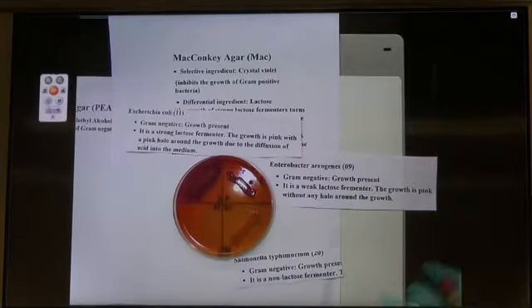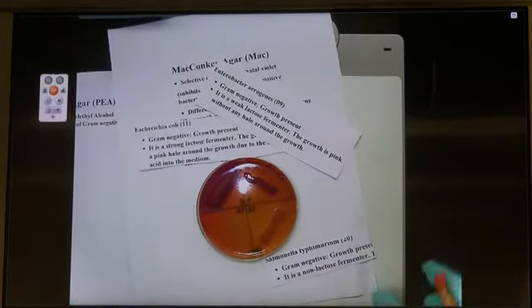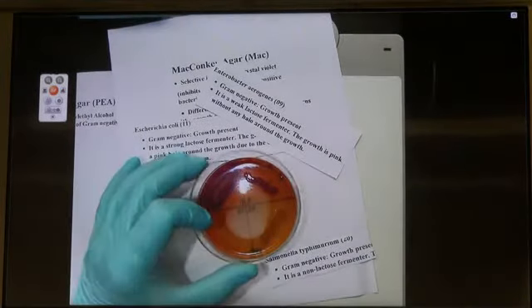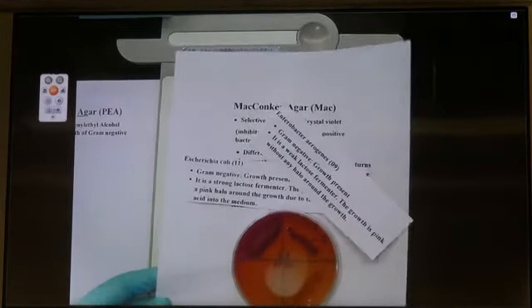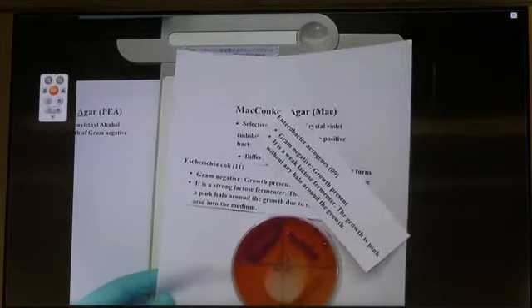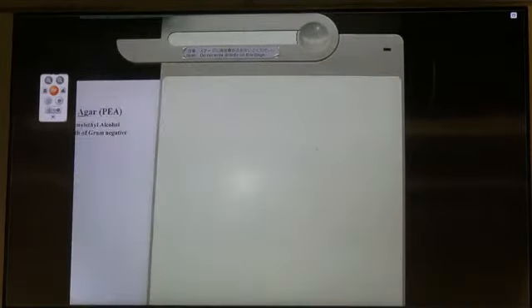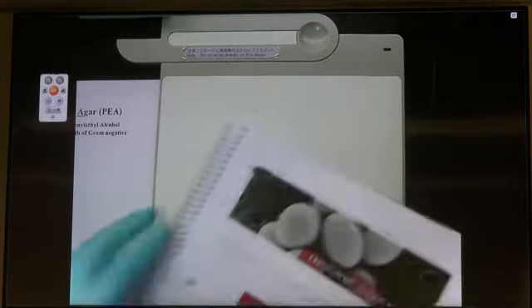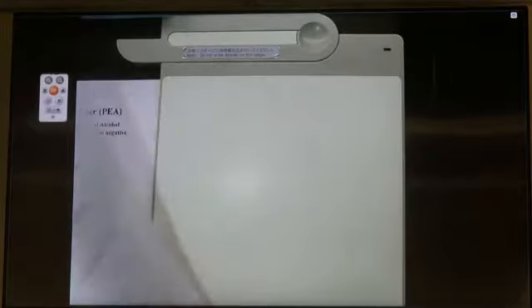Let's fill out the chart. So why does it look kind of yellow? Just the byproducts. Because they do produce waste, metabolic waste, but not the acid. So for 23, you want us to put NA for that? Let's see. You're ahead of me, Stephanie.